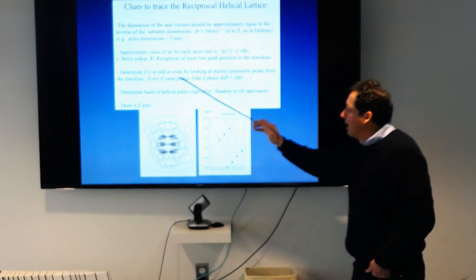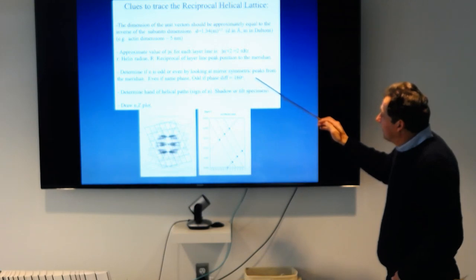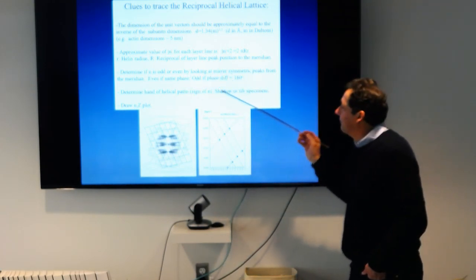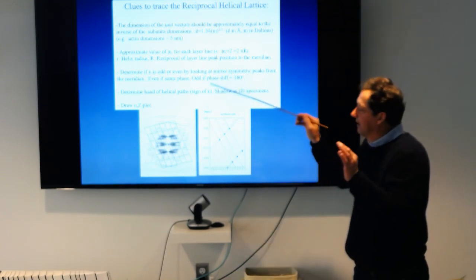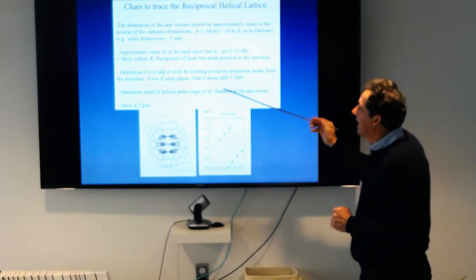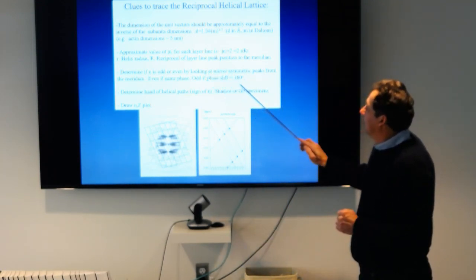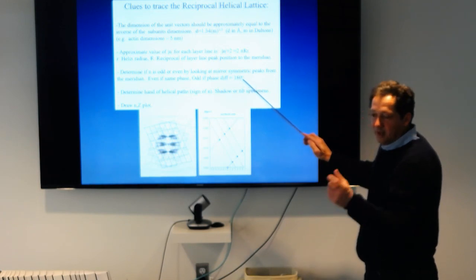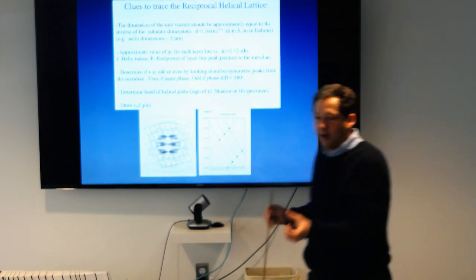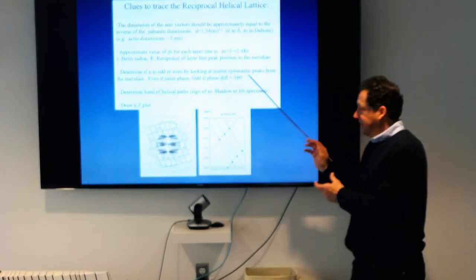One way to do it is to decide whether n is odd or even. If you can do it in the Fourier transform, you look at the phases of the points, whether they are in phase or separated by 180 degrees. That's one way to say it.